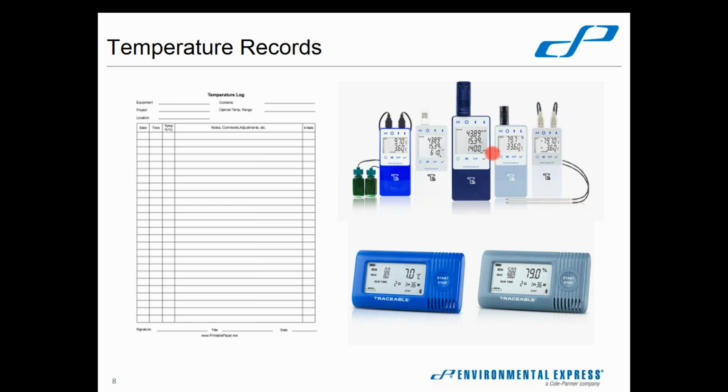And they do a continuous reading of, actually I guess they're more than Bluetooth, they're actually Wi-Fi enabled. They do a constant reporting of temperature, so you set them up for the frequency to be monitored, and they report on whatever basis you tell them to the cloud, and all the temperature data is stored, and you can set it up with apps to smartphones or tablets or computers, depending on who needs to know about things.